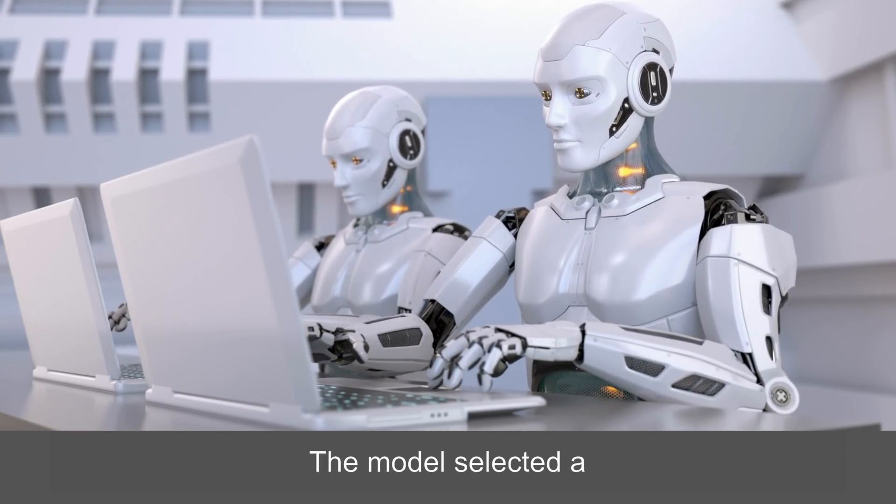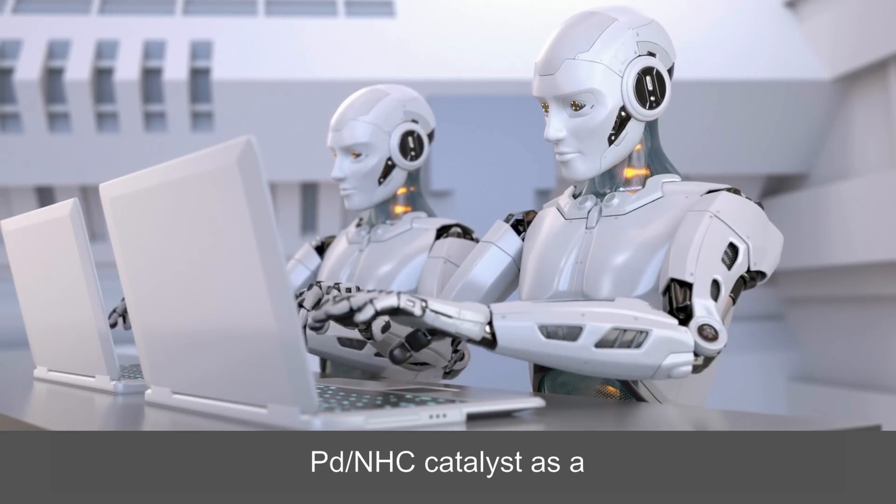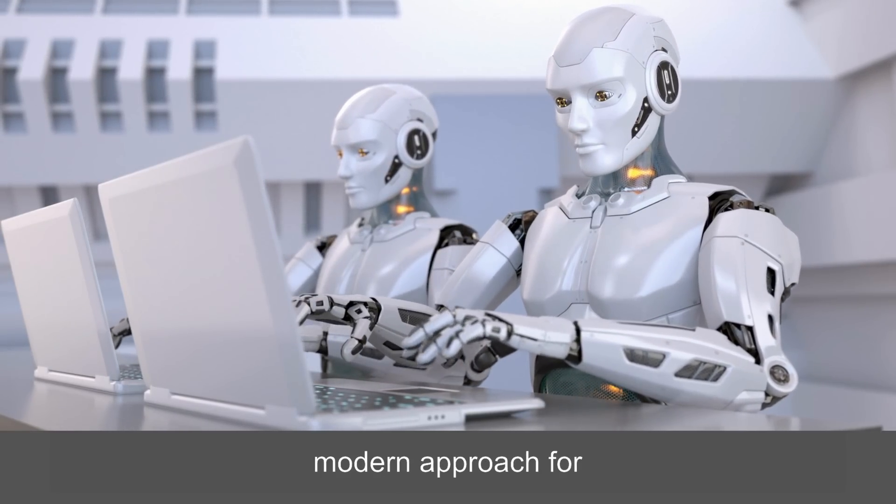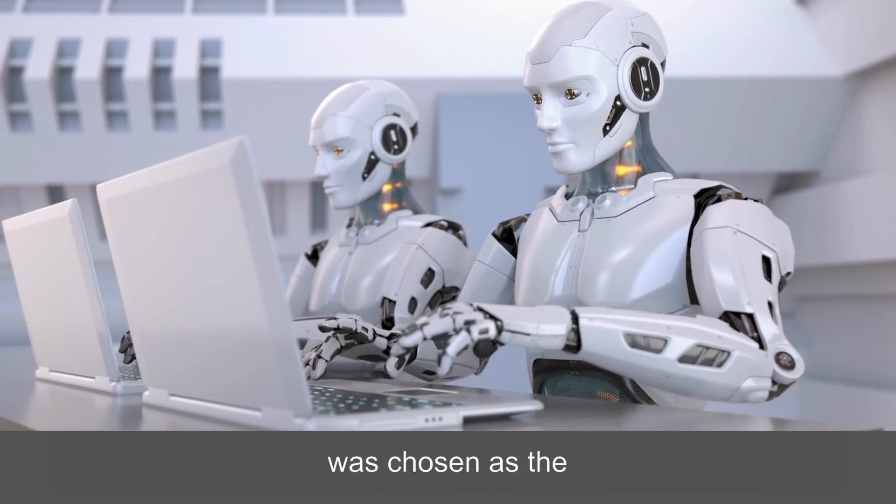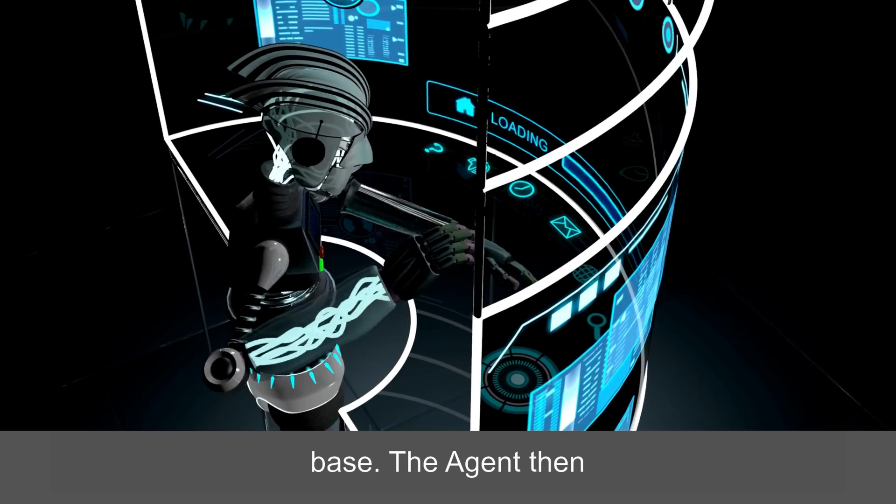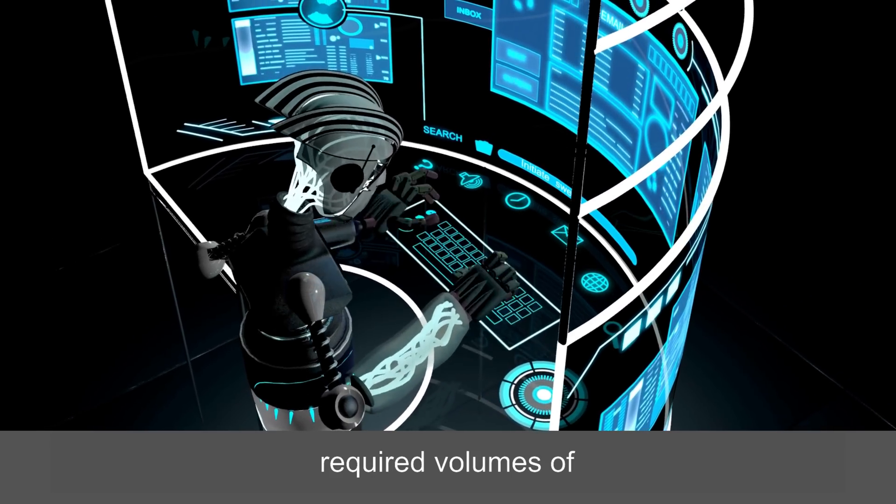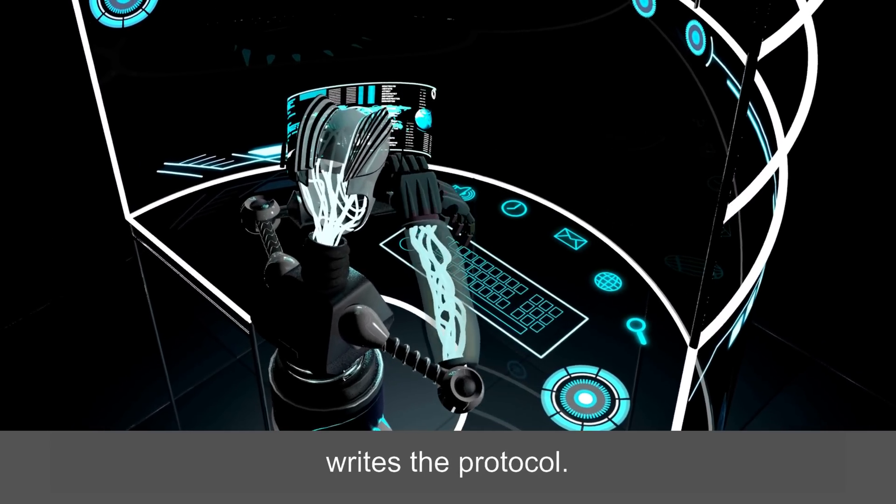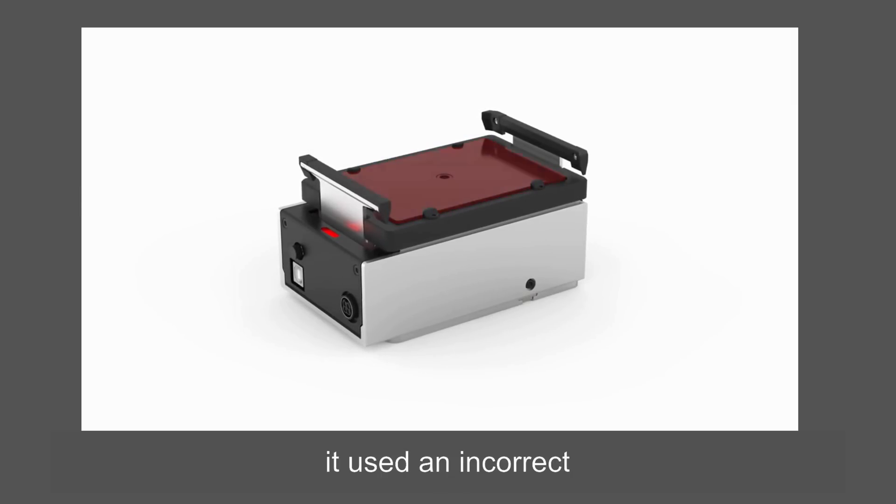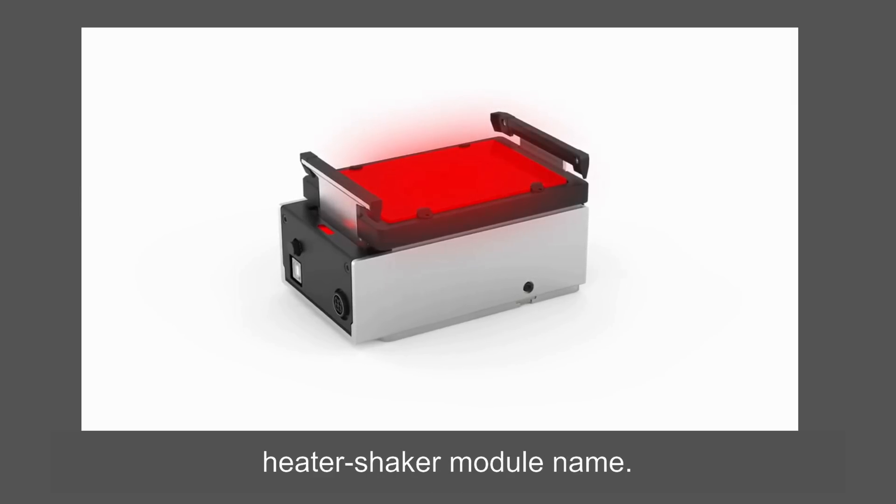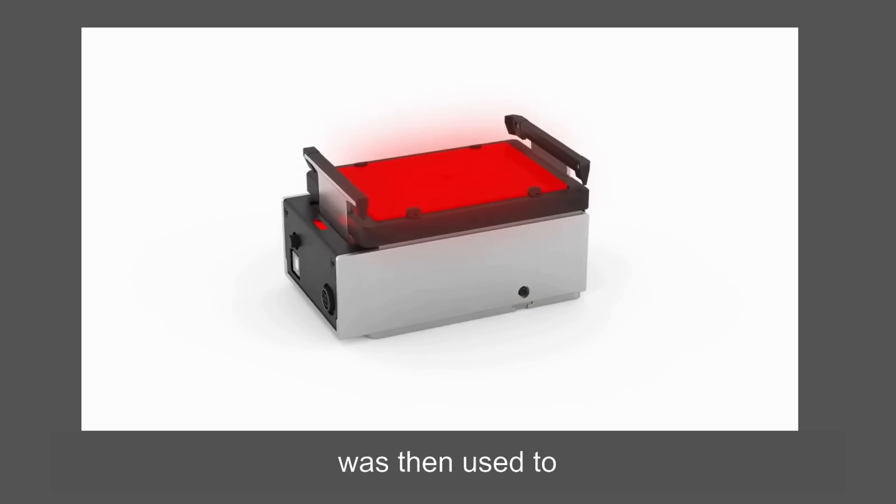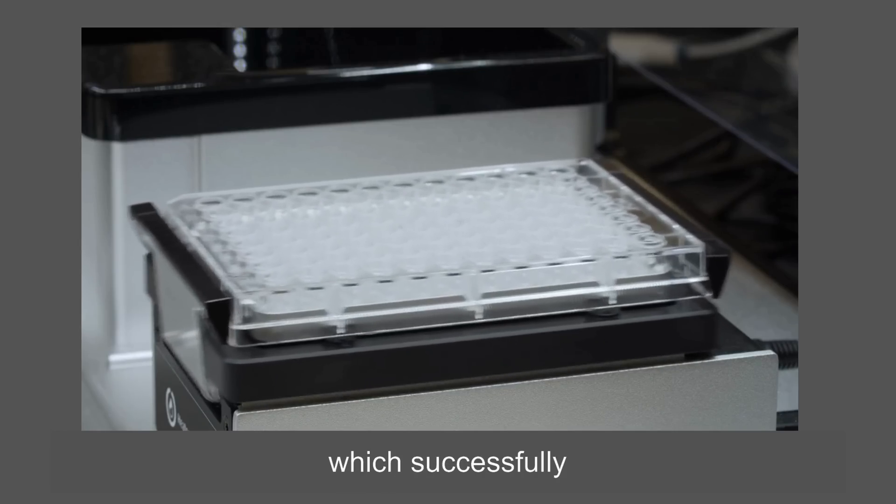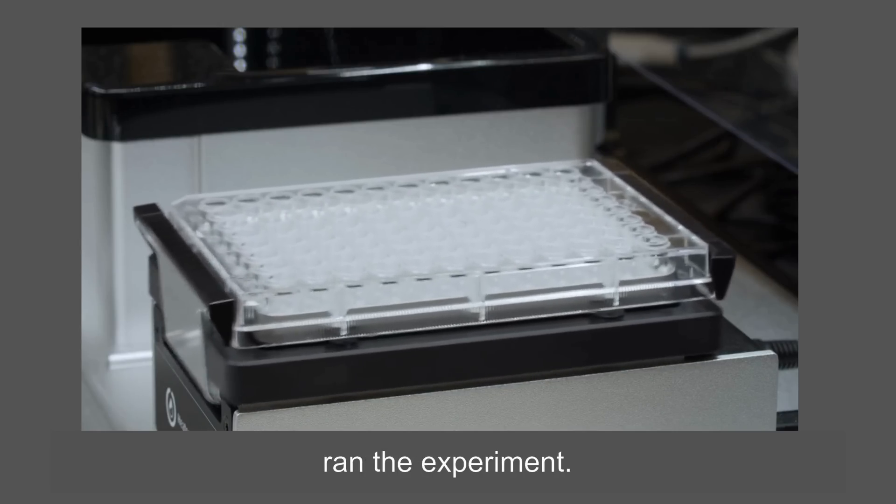The model selected a Pd-NHC catalyst as a more efficient modern approach for cross-coupling reactions, and triethylamine was chosen as the base. The agent then calculates the required volumes of all reactants and writes the protocol. However, it used an incorrect heater shaker module name. Upon noticing the mistake, the model consulted the documentation. This information was then used to modify the protocol, which successfully ran the experiment.